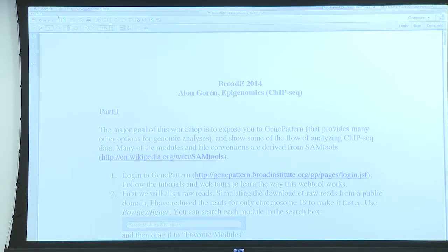So I took ChIP sequencing data for H3K4me3 and H3K27me3, and a control, which is the whole cell extract, which gives us a reference of what the non-enriched, non-fractionated genome looks like. And then we will convert them into BAMs, use IGV to visualize them, and then we can do some further analysis. But this is an overview of the workshop.